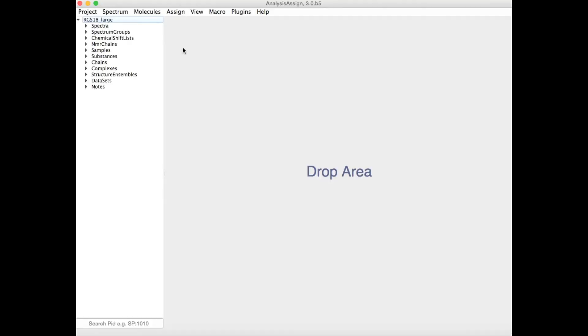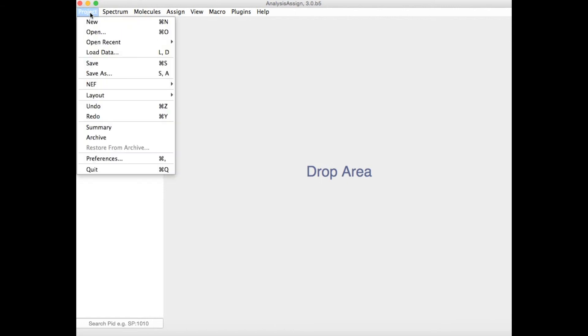Version 3 of Analysis is completely compatible with the new NMR exchange format. You can import or export NEF files in order to move easily between different NMR software packages.